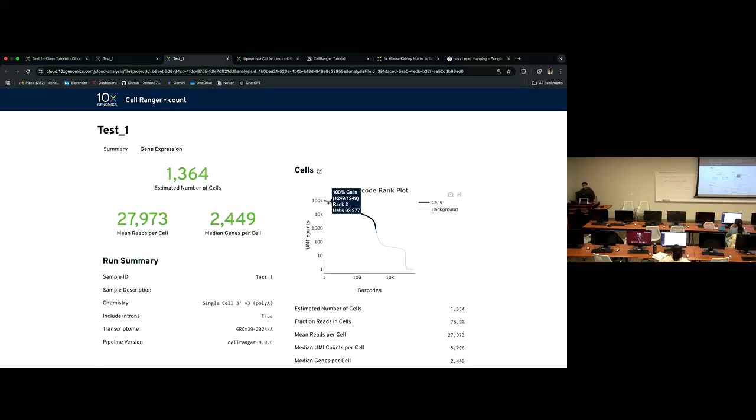But I will send you the filtered H5 files, and they should also be getting the same filtered H5 files so that you can run it on the MATLAB.